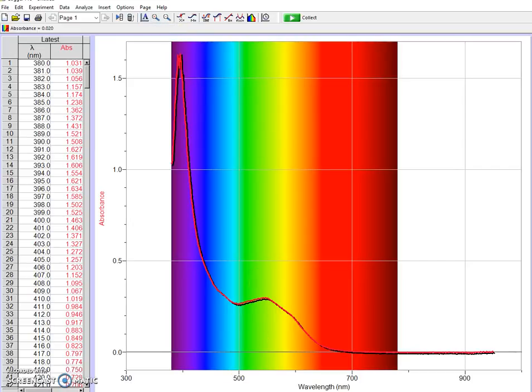And you'll notice that this Red Tide has gone from about 350 nanometers all the way up to not quite 800 nanometers, and we've got a nice little peak here and here. What we can now do is find out what that peak wavelength for the absorbance is in both areas.